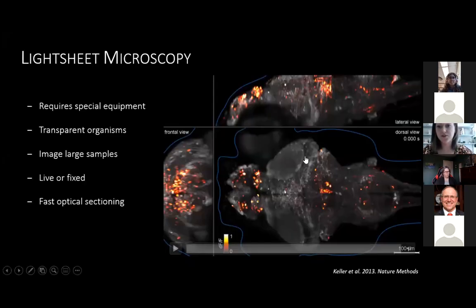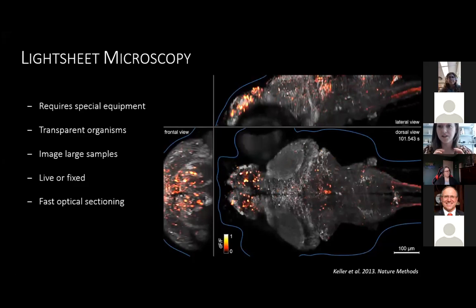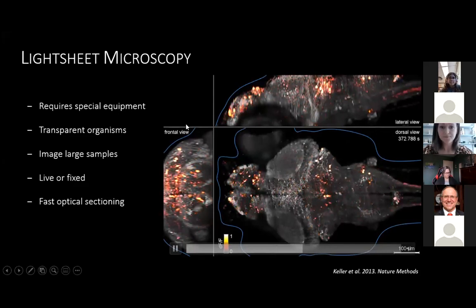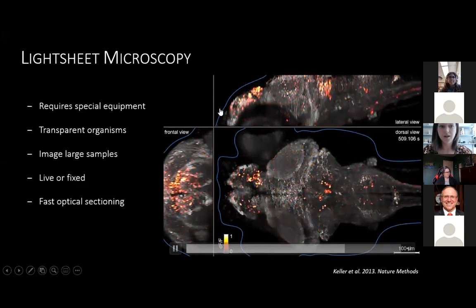And we are able to, for example, image neuronal activity. This is a zebrafish larva. And if I play the video, you can see little flashes of light. And every time you see a flashing light, that's actually a neuron that's being excited because it has a calcium channel labeled fluorescent protein. So we have our resolution in XY, but then we also have a depth of the image as well. So we have a three-dimensional representation of our sample.